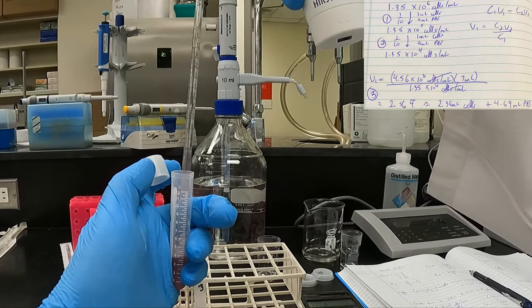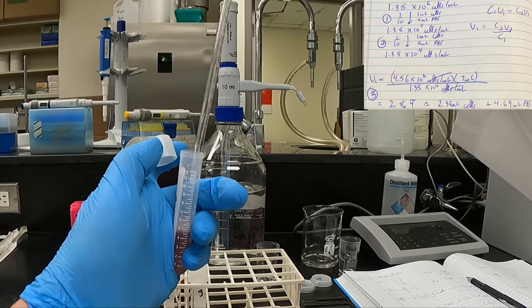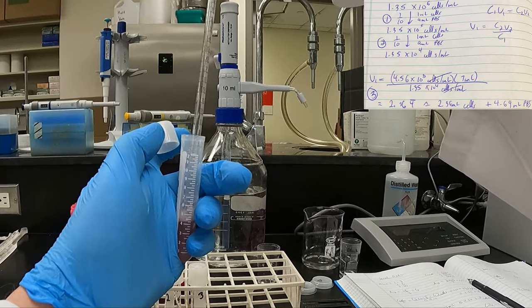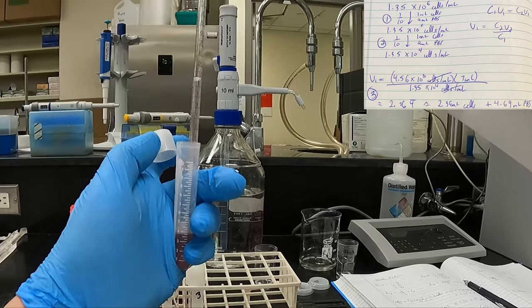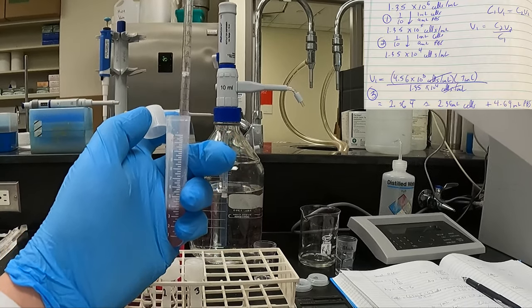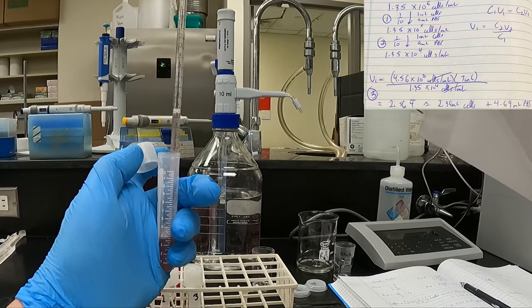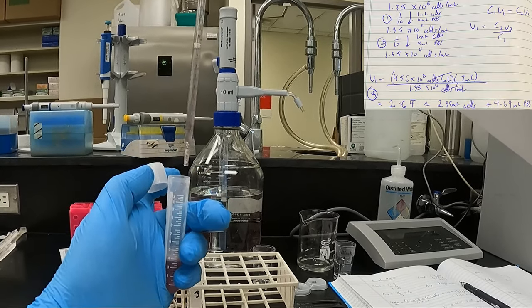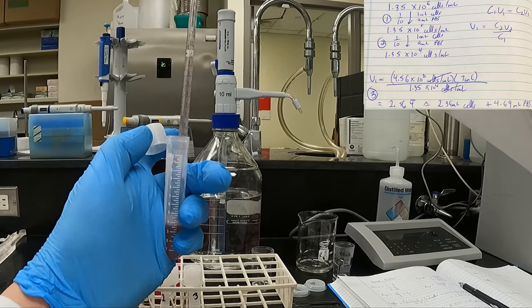Every time you transfer one of these solutions, whether it be a solute or a solvent, if you make a mistake, there's no way in the end you'll get the right concentration. Now, I use 10 and 5 mil pipettes all the time. I don't generally use the 2 mil pipettes. As you can see from this, it's going to take me some time to get this right. But I want you to take your time.